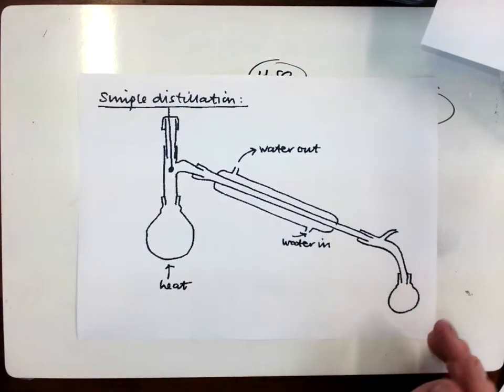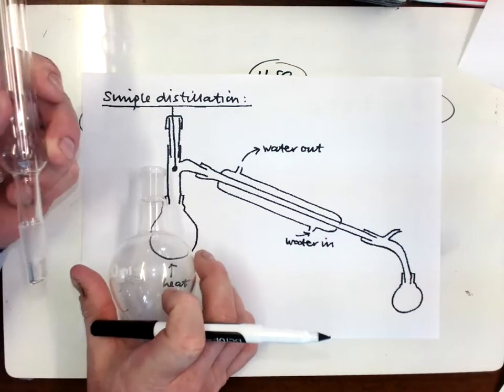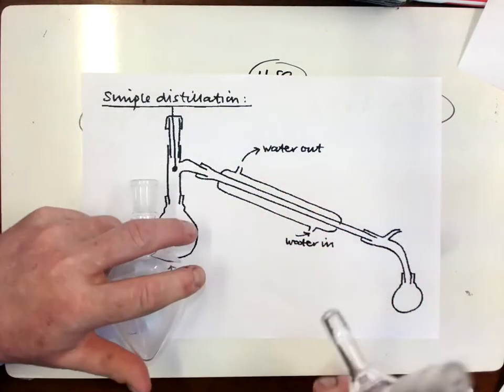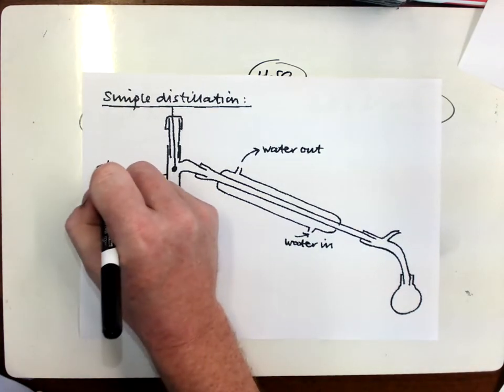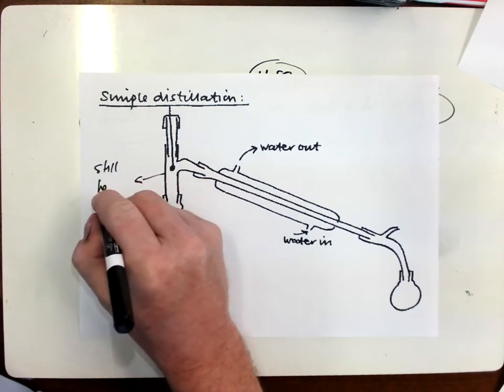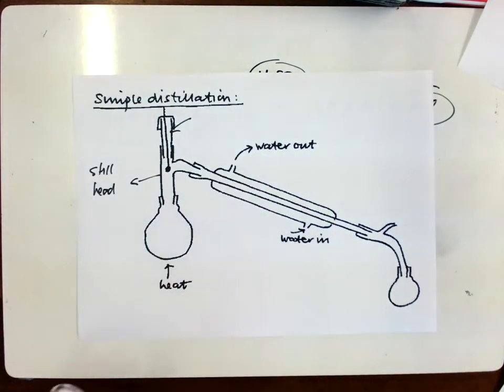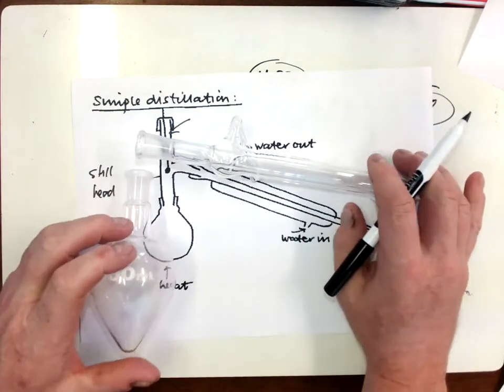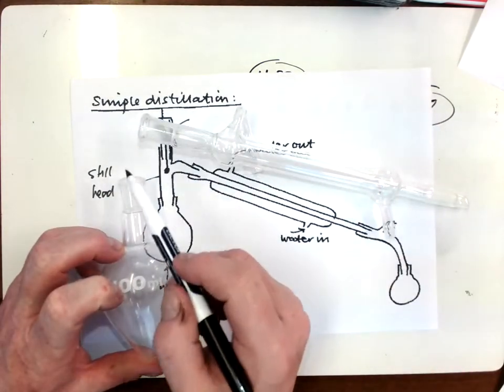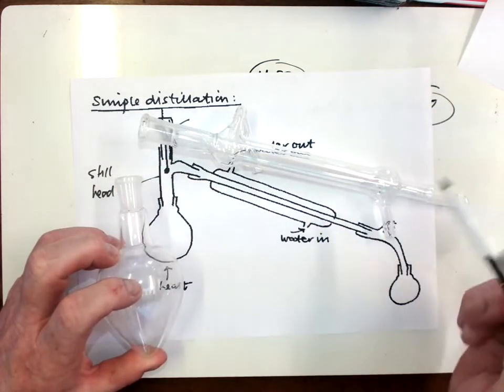So what we'll do is we'll take our little flask, which we have here, and we will change the system. We'll put in what we call a still head, and we'll now bung it, and we will heat it here. And what that will do is, again, we'll get that sort of a setup. I haven't got a still head here, but you get the picture. We'll put something in there which forces any vapours up and across.